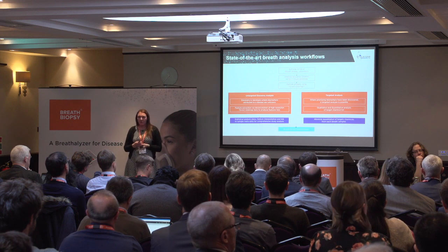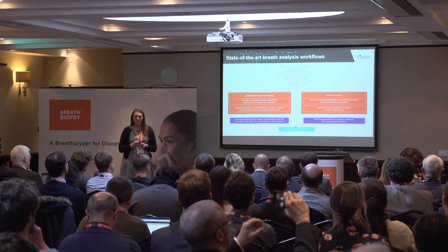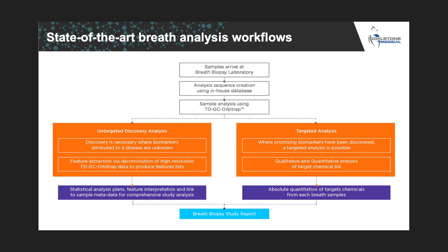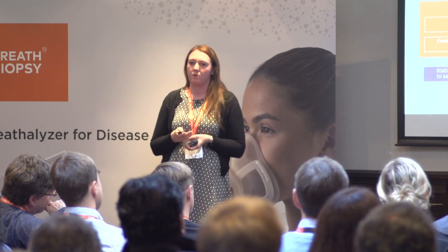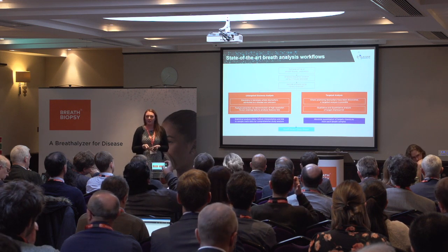So to speak a little bit more about the analytical workflow once samples arrive back at the laboratory. Our first steps are to receive those samples, analyze via a standardized sequence creation, and collect data from the breath samples using our TD-GC-Orbitrap. The new addition that's coming alongside the introduction of the new instrumentation is a dual analysis approach, to do discovery untargeted analysis alongside a targeted analysis.